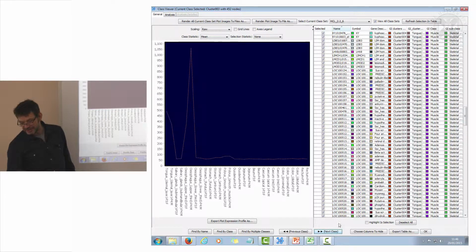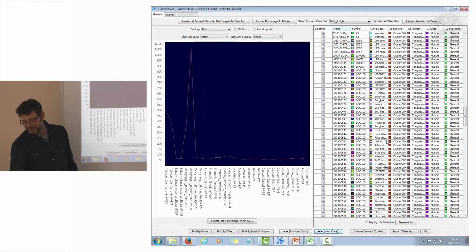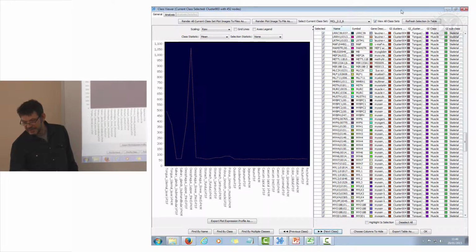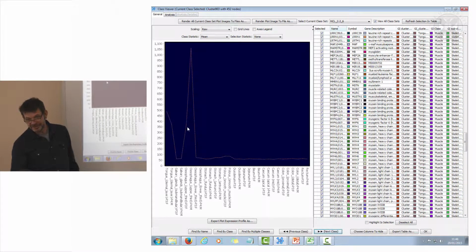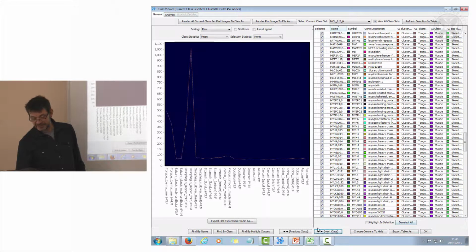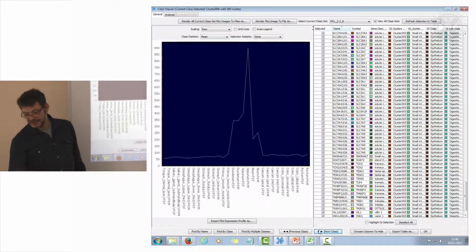Next list. So similar but different. So this is mainly in the tongue. And actually in one of the esophageal samples. And if I go down here, you'll see myosin, myosin, myosin, myosin. It's muscle, okay? So you can take this big data up and you just basically divide it up into chunks and you can go through it.